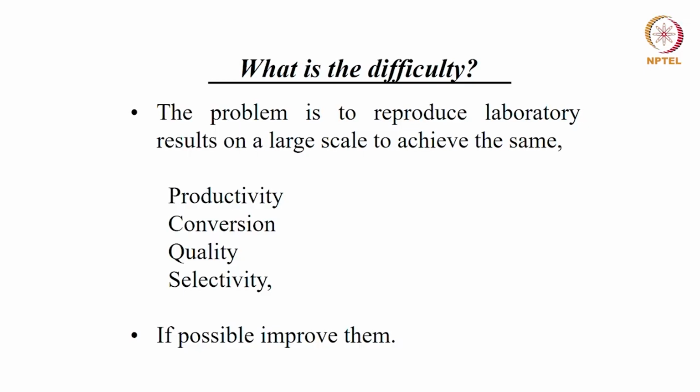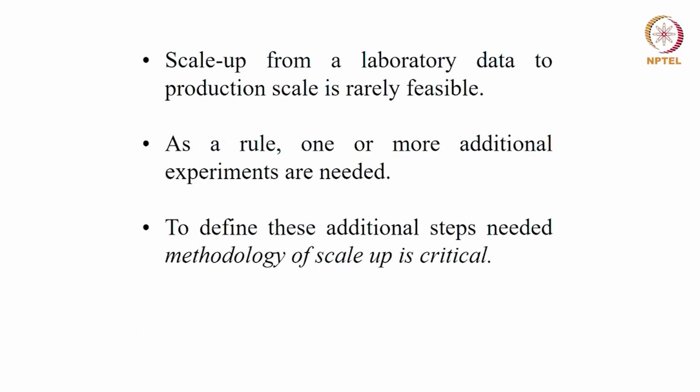But generally, the key is to reproduce the result. Now, scale up from laboratory data to production scale is rarely feasible and very challenging. As a rule, one or more additional experiments are anyways needed. So to define these additional steps needed, the methodology of scale up is critical.